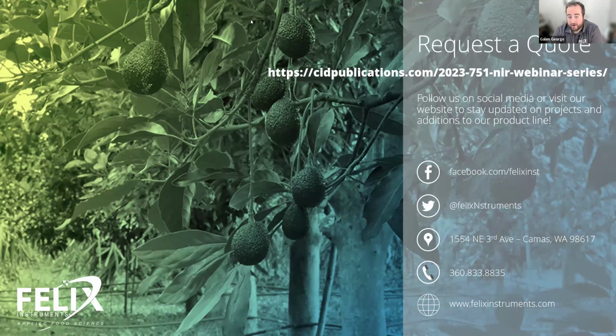Our calibrations are built with multiple seasons' worth of data, and they're meant to be as robust as possible across multiple regions, with as many assurances as the manufacturer can give, being transparent about our results and what our validation looks like. The best way for the user to be assured that a prediction is accurate is to perform the initial offset calibration, which is required for any new instrument that you purchase.